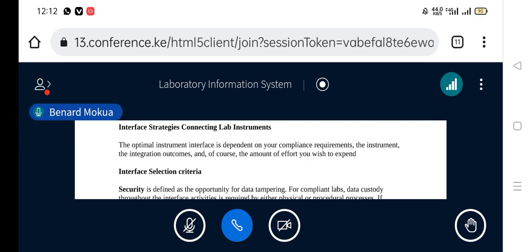And then number three, about this instrumentation, we say that what we value in the lab is the characteristics of results, so that they must be accurate, and being accurate, they must be precise, and they must be timely. So results from our instruments should be like that.